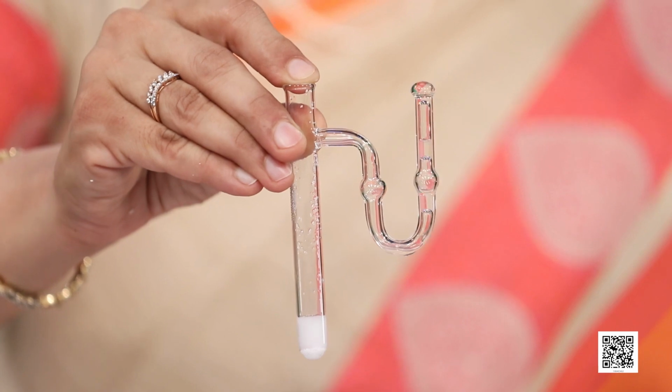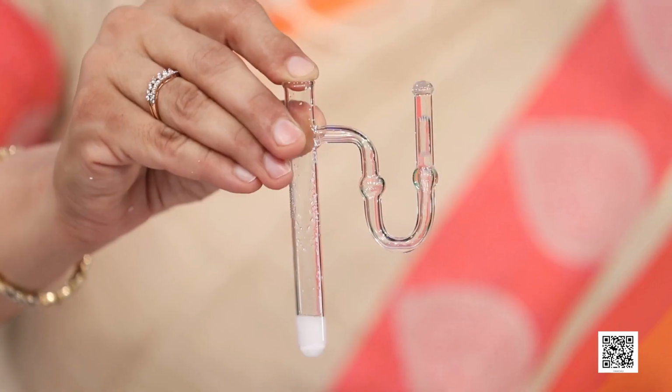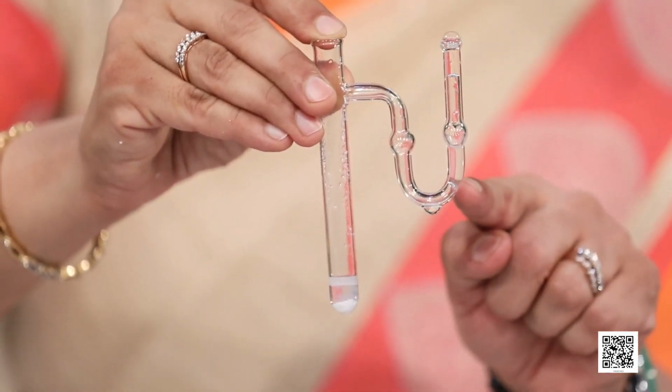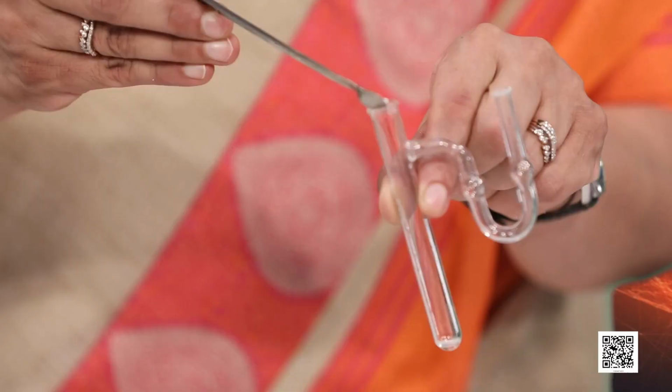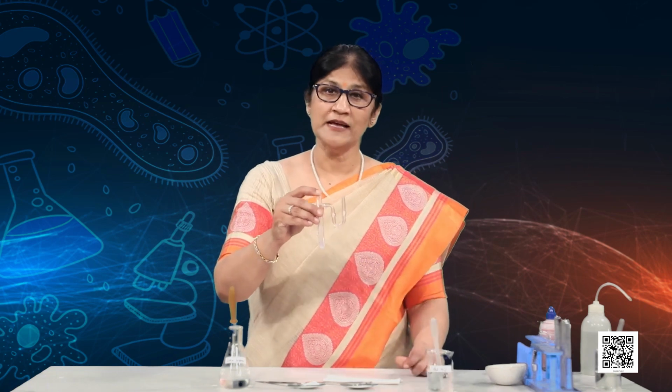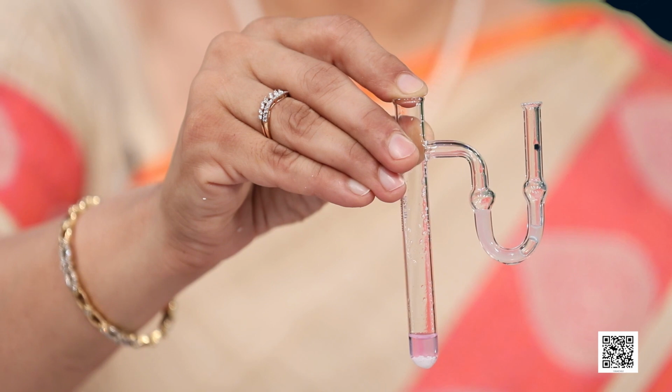So, can you see this brisk effervescence rising, and the lime water in the arm of the U-tube is turning milky, and the bubbles that are rising, these are the bubbles of carbon dioxide. And as the amount of carbon dioxide that passes through increases, slowly the lime water again turns colorless. Can you see that? The milkiness is disappearing. Let us repeat the same experiment with sodium hydrogen carbonate and HCl. Yes, it also gives us brisk effervescence, and yes, again lime water is turning milky, and the milkiness disappears with passing of excess carbon dioxide.